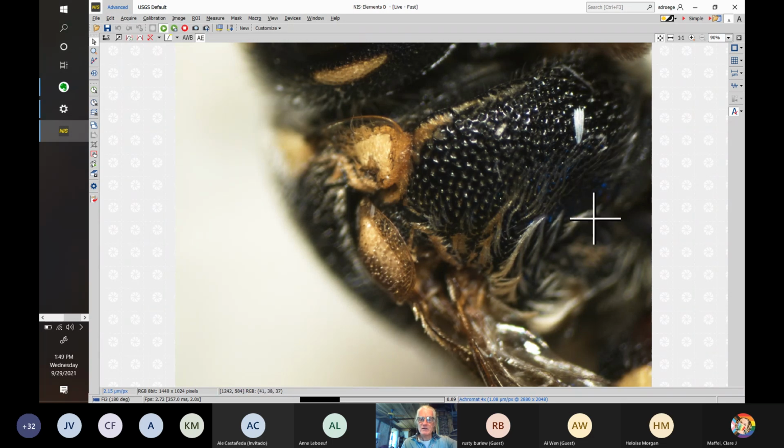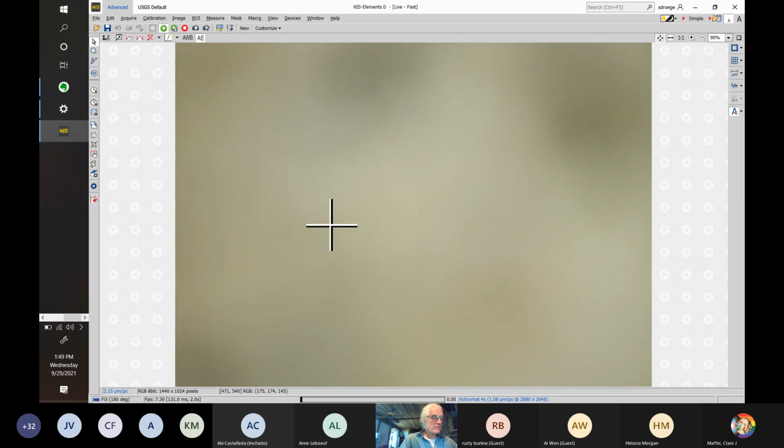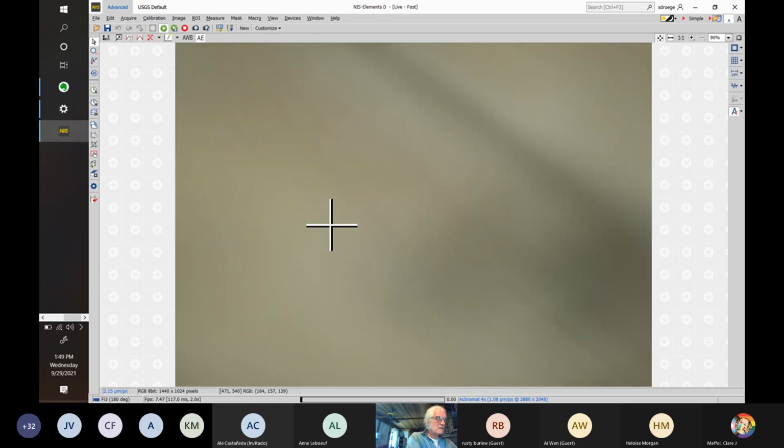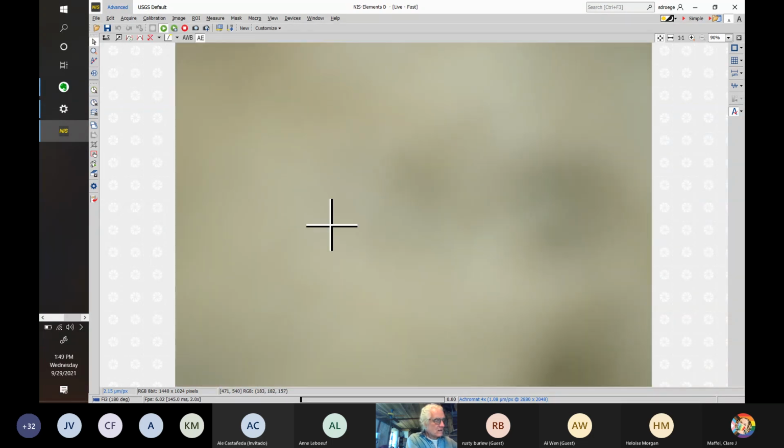The mesepisternum is this big section here, and here's the front face glossy, and that leg is going to tuck right in there. So let's just take a quick peek at the male bee, and then we will do a Trachusa if we have time, which I did not have time to look up, but maybe we will do some hand waving and look at it, because I did not have any specimens any longer in our synoptic collection, and two, the internet was down.